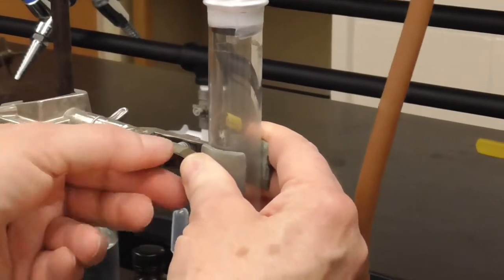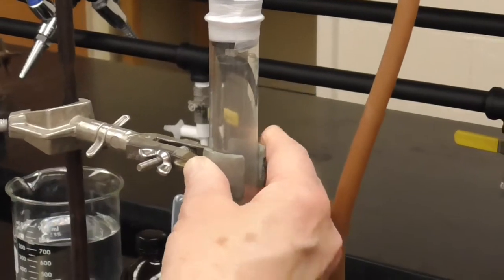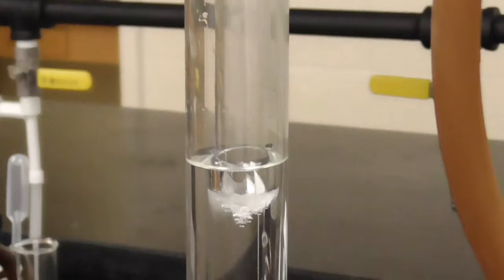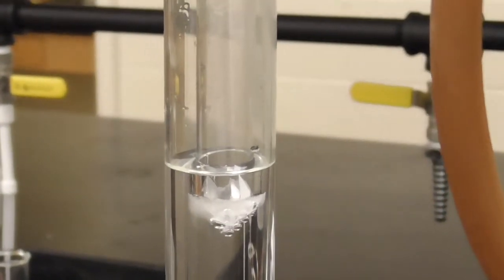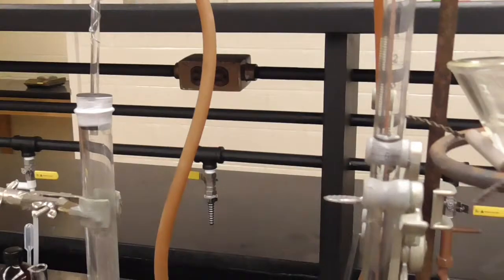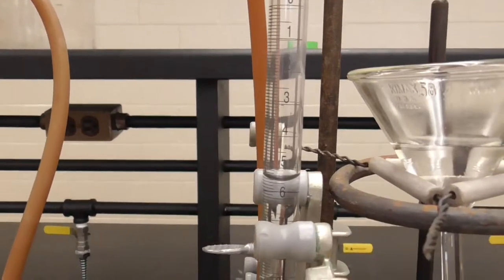As that reaction gets going more and more, the hydrogen gas, which you can now see more bubbles forming, will flow through the tubing to the burette, and as that pressure builds up inside, it will start to push the water down.